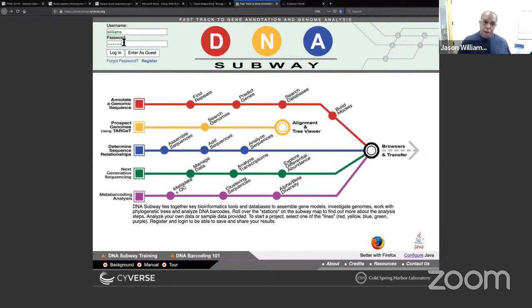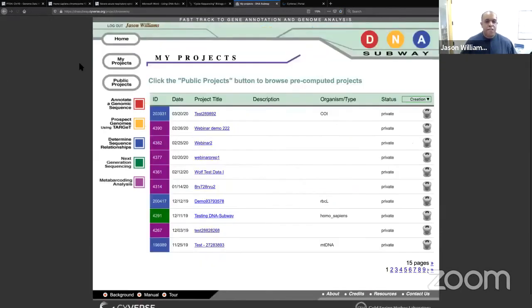So if you want to follow along as a guest, go ahead and do that. And we won't go so far along that it'll take you a long time to recreate what we've done. So I'm going to go ahead and log in. When I log in, I see a whole bunch of projects that I've created in the past.